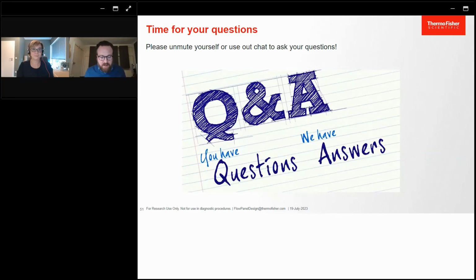Great, thank you. Another question that we have is, how long does it usually take to get a panel back? Yeah, you will get for sure a first reply within 24 hours, but after that, it all depends on the complexity of the panel.